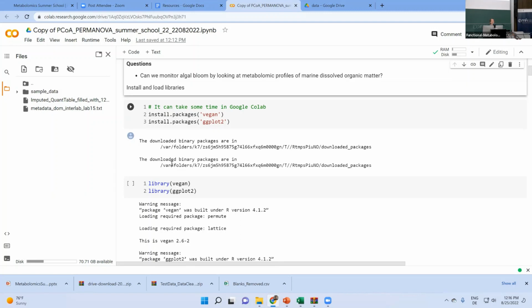Anyone still needs help, or things are getting solved? Yes. The name is not exactly what it is. Okay, the file name doesn't matter. As long as it needs to be the imputed data table, as long as that's the case, it's fine.